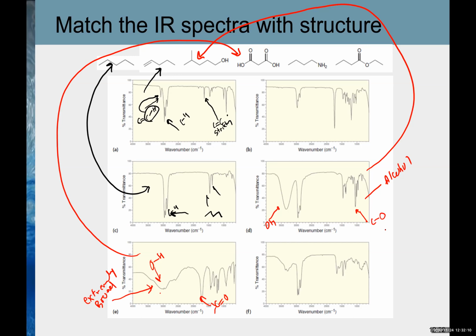It's the CO stretching. Yep. And what is this peak? CH stretching. Yeah. And then this one, CH2 bending. CH2 bending. You guys are expert now. Okay, so 2 more to go. It's easy now.